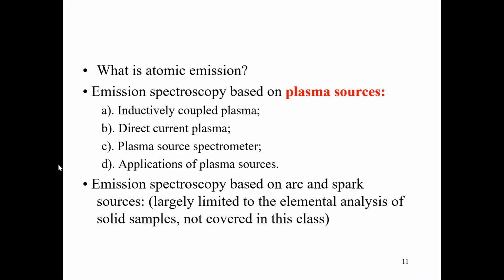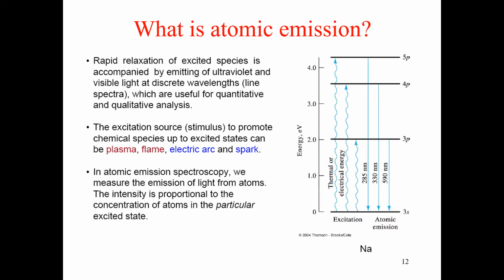This is largely limited to the elemental analysis of solid samples, and we are not going to cover that in our class. So let's move on to atomic emission.